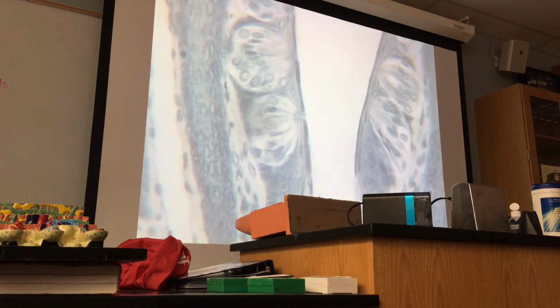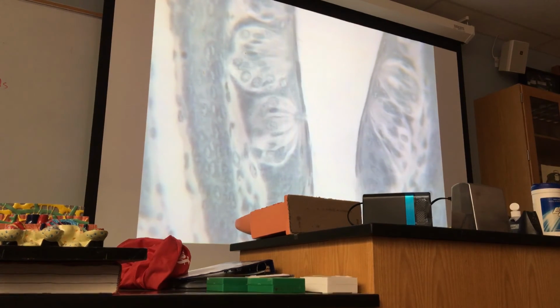Look, a thing of beauty is a joy forever. Look at that. These are the special cells. Here is the taste bud pore through which food molecule enters, maybe say a sugar molecule, okay? And these cells will be stimulated, they will generate nerve impulses, and that will carry nerve impulses to the somatosensory area of the cerebral cortex, where that will be translated as a taste sensation. Oh, it's so sweet. Yeah?